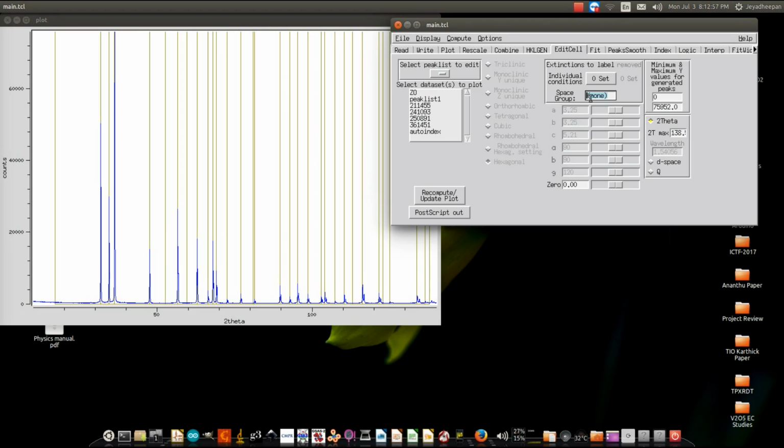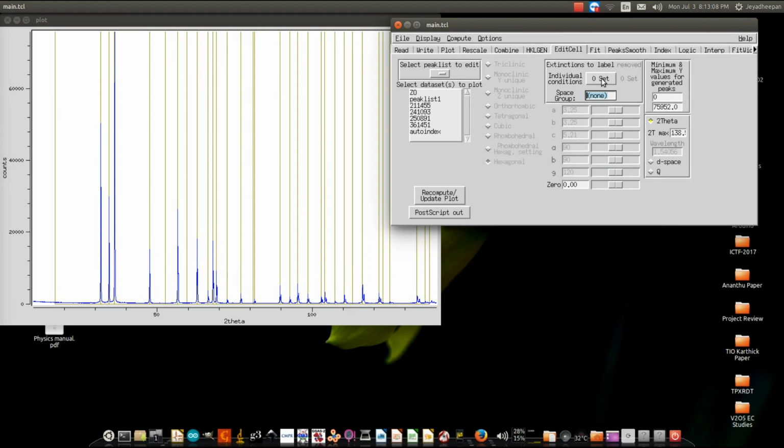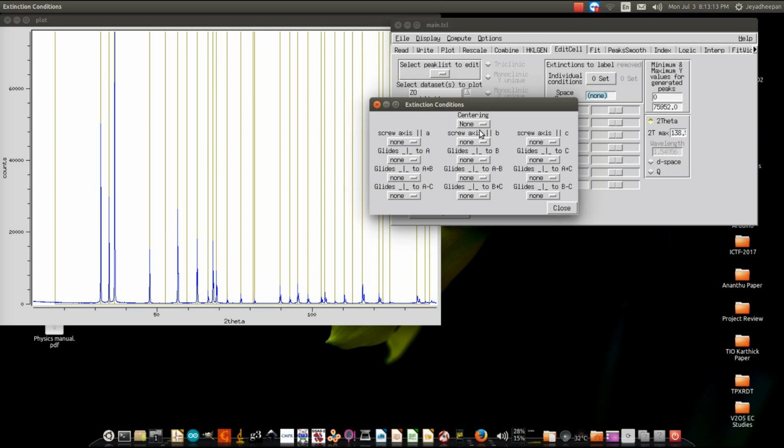Here the figure of merit should be a high value, 77.2, something like that. So you cannot select that 24.9. You have to have the figure of merit as a greater value. So here I am going to select this particular one, this is my possible result. Before viewing the output, you have to select the zinc oxide here and press view.